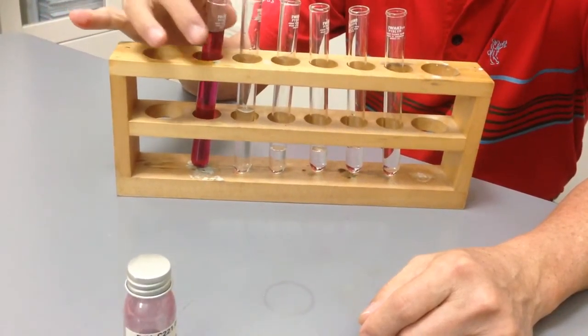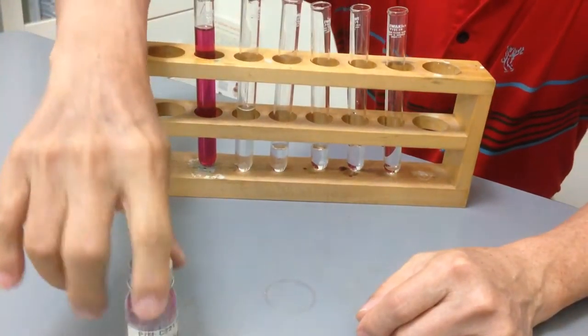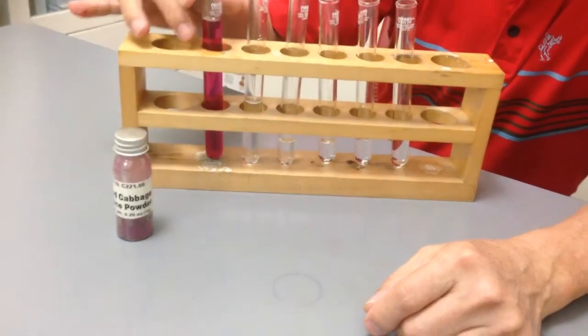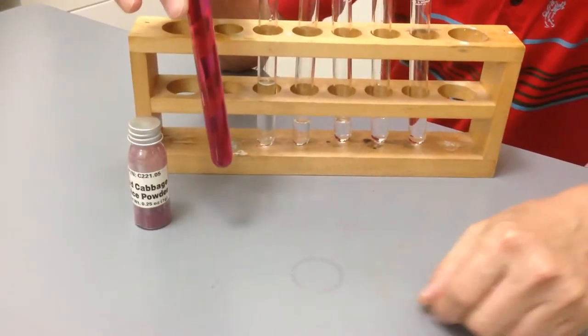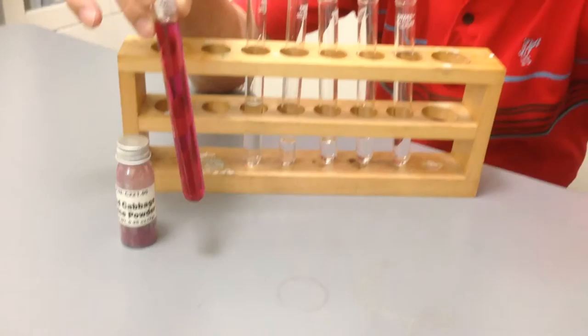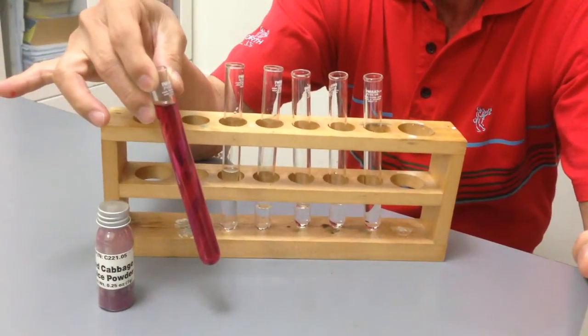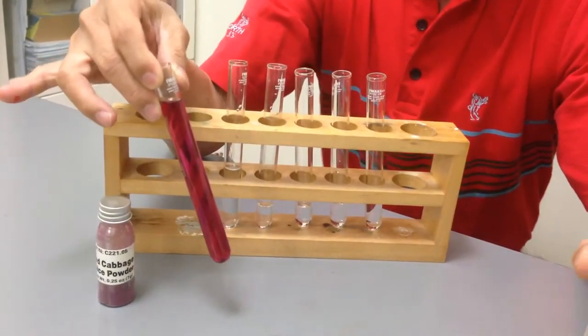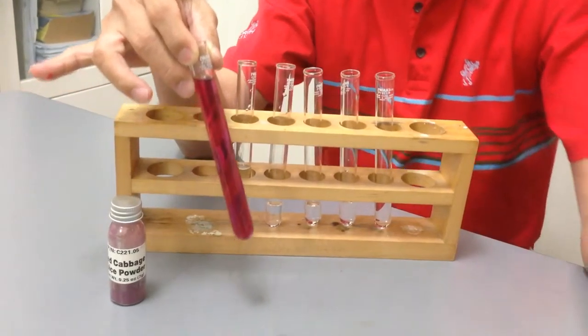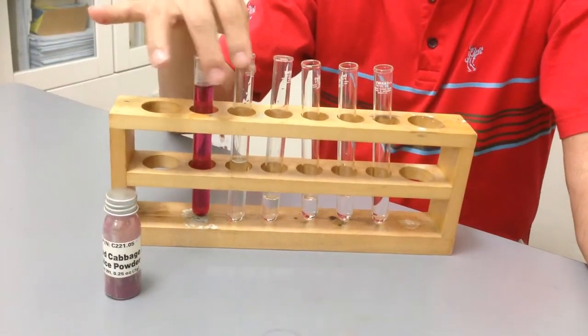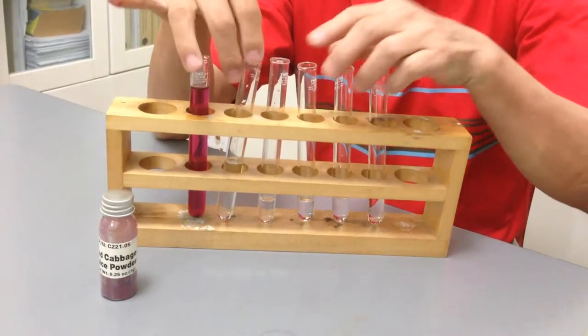We have a red cabbage powder which we made into a solution, and it is an indicator for acidity and alkalinity. Now over here we have five test tubes.